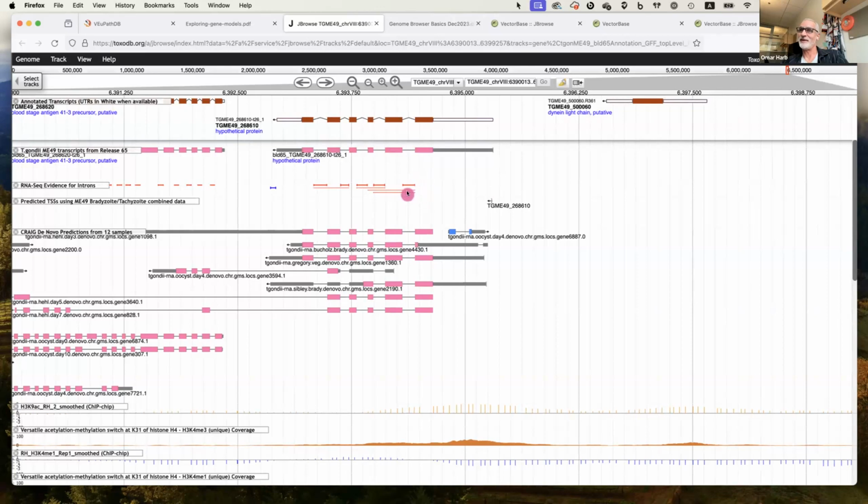You will notice, however, there are additional intron spanning reads for this particular gene, and they're not nothing. I mean, they're not like 0, or just 5 reads. This particular species of intron spanning reads has about 1,350 of them. So by this logic, you can argue there are at least 1,345 reads that support that this exon could be skipped in some cases.